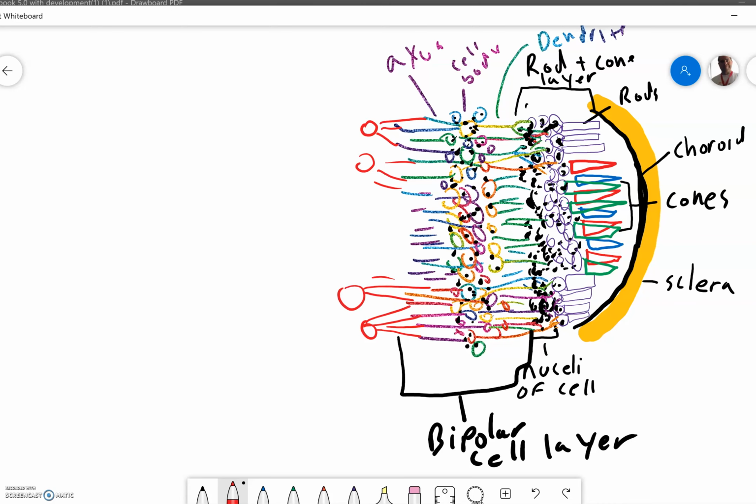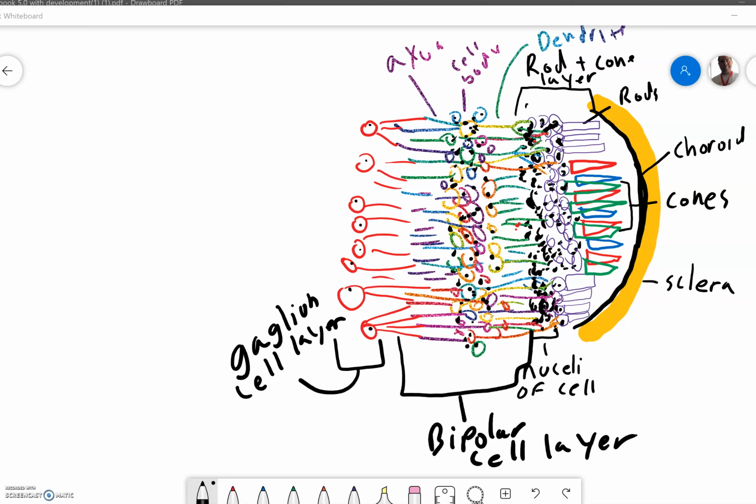So it's very sparsed out. Over here, I'm going to have a lot more just because it's a one-to-one issue. But still, there's going to be less than you would have otherwise. So these are the ganglia cell layers. And again, they need nuclei. So that's the ganglia cell layer.